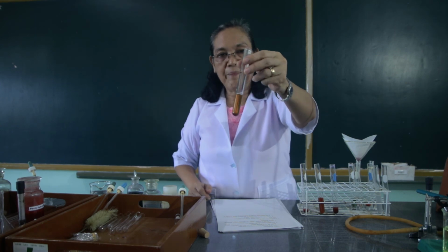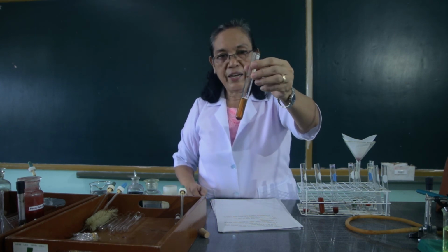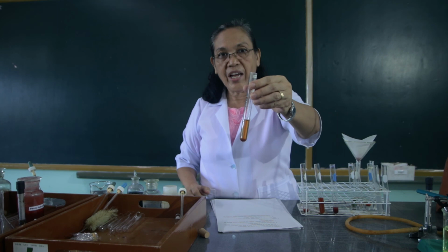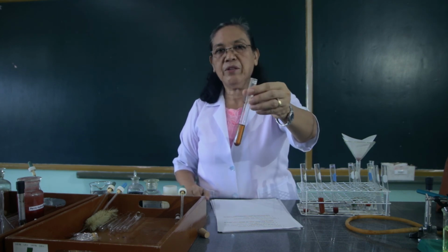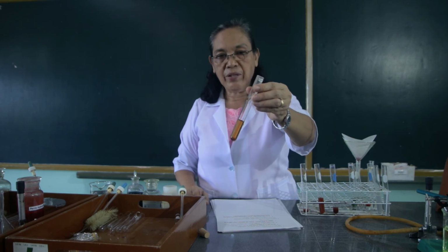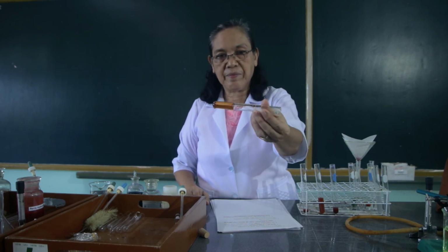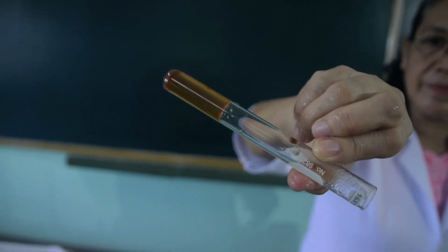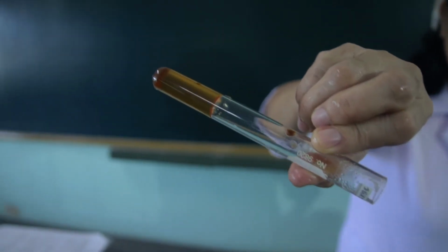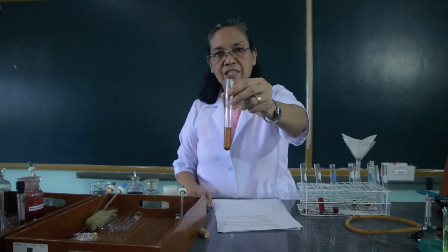Okay, observe what happens. A while ago it was liquefied and it is called a gelatin solution. Now after cooling it for some time and then running it with cold water, I want you to observe what happens. So you cannot pour it out anymore. So it has solidified, and this is now called a gel.